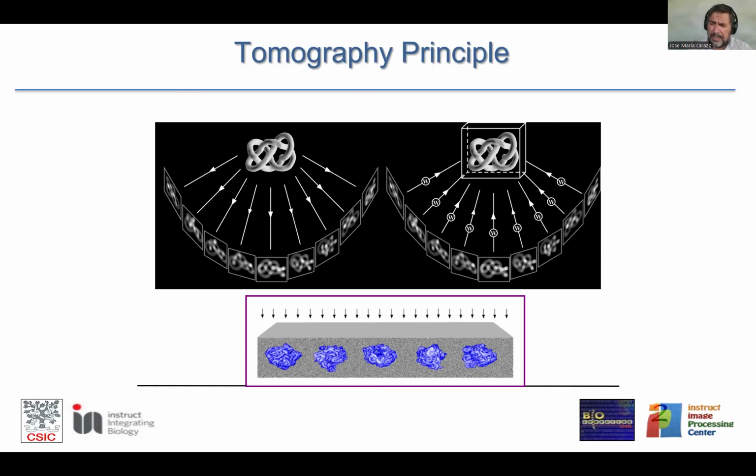the Nobel Prize 2017, but there is a huge trend that is still cumbersome, but is there, that is cellular tomography. That is, this process of purification, of enrichment, of anything is a perturbation. Really, what you are looking at after the purification certainly is related to what was there in many ways, but maybe you are forming some complexes that didn't exist.